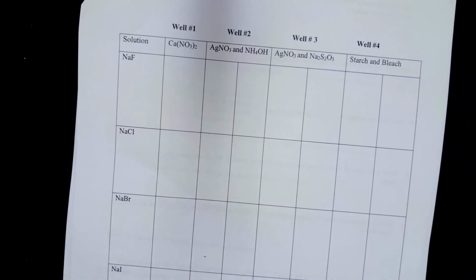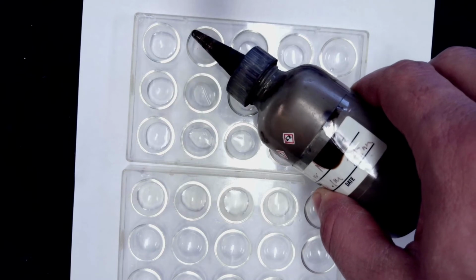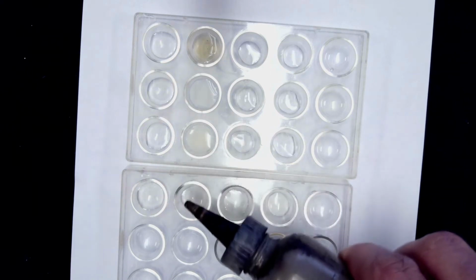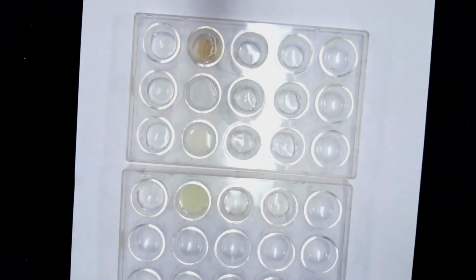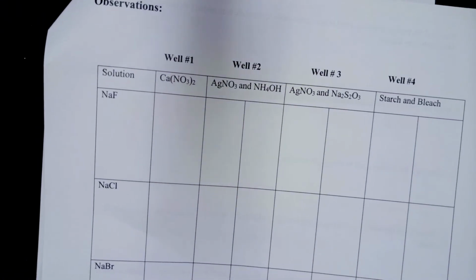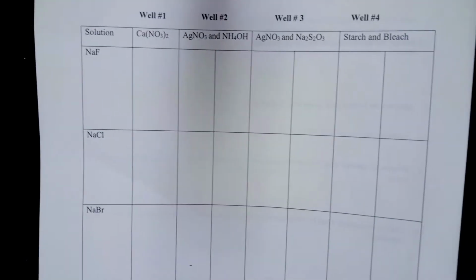Now we're going to add silver nitrate to well 2. And you can't see it, but some of them are forming precipitates. They're forming white precipitates. I ended up taking the white paper out from underneath it so you can see it. I believe I did anyways. You're going to end up writing your observations right there. Okay, I guess I didn't take it out.